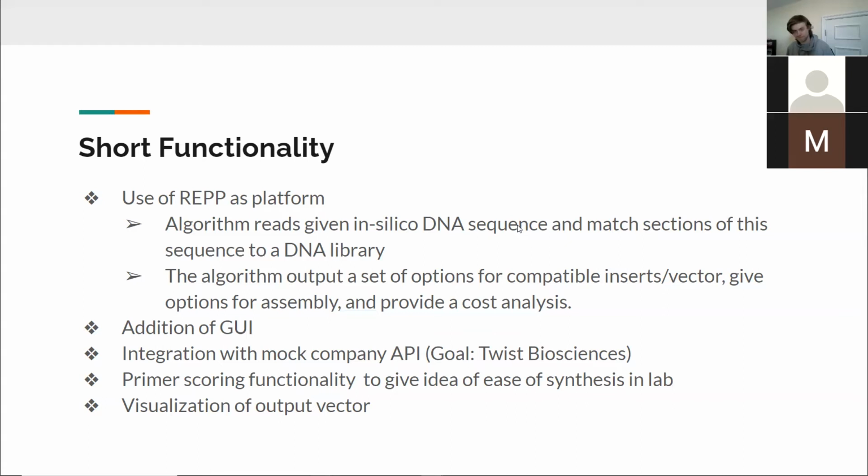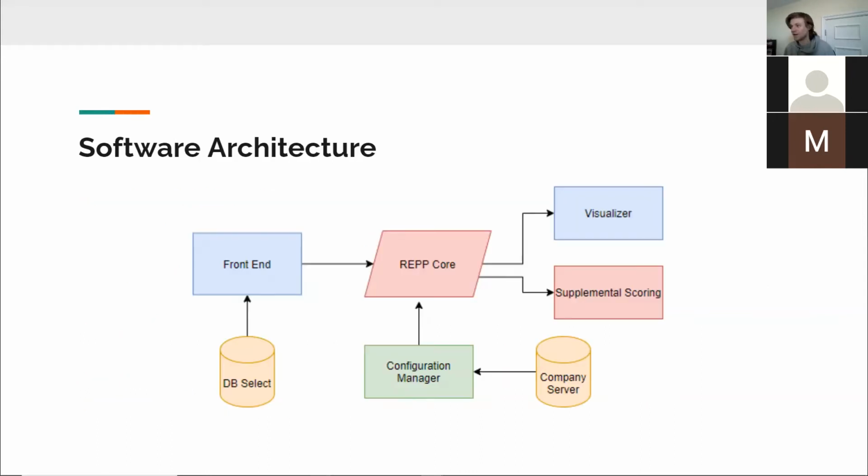Lastly, the visualization of the output vector shows a circular plasmid with different fragments and their locations, as well as their cost for each part. The software architecture for PCADA is shown here.